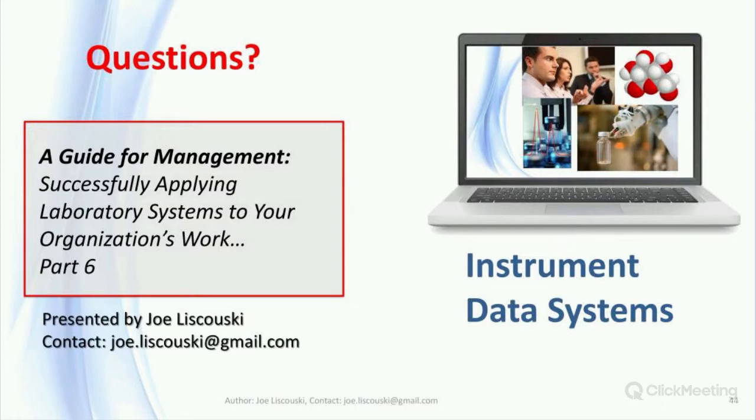The silo problem is increasing as we start dealing with collaborative efforts, working with results that are developed perhaps by contract laboratories or outside services. They have their silos, you have yours, and then the results go off into other people's analysis and use. So it is a significant issue. It's a data architecture problem that requires planning and really thinking things through. And of course, all these systems require backup and archiving.